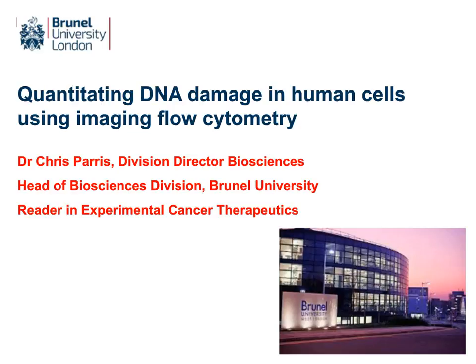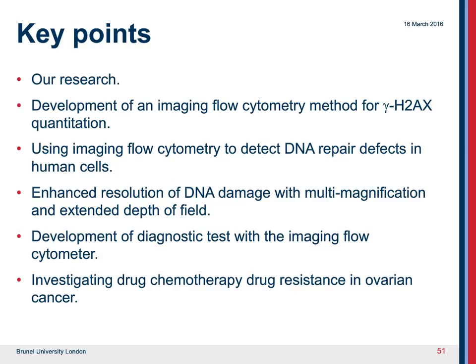The key points of today's talk will be first to tell you a little bit about our research, then talk a little bit about how we've used imaging flow cytometry to develop a good method for gamma H2AX foci quantitation. Then I'll go on to say a little bit about how we've used imaging flow to detect DNA repair defects in human cells. These would be inherited repair defects.